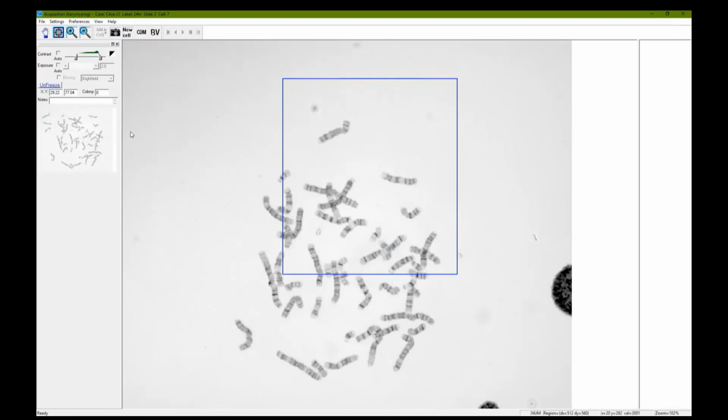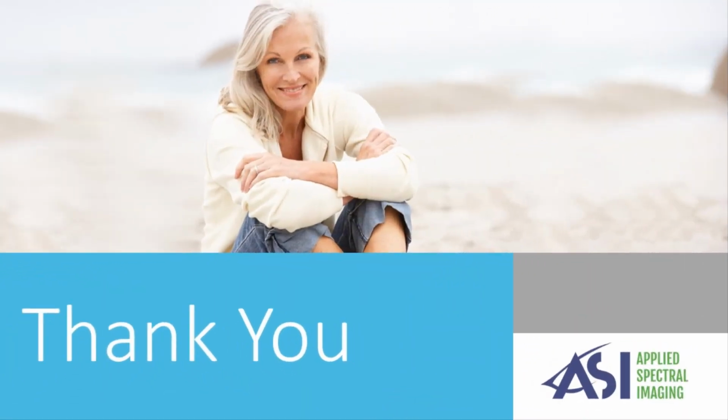This completes the overview of manual chromosome capture.